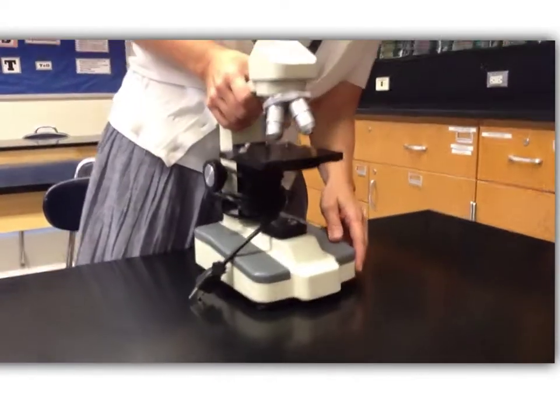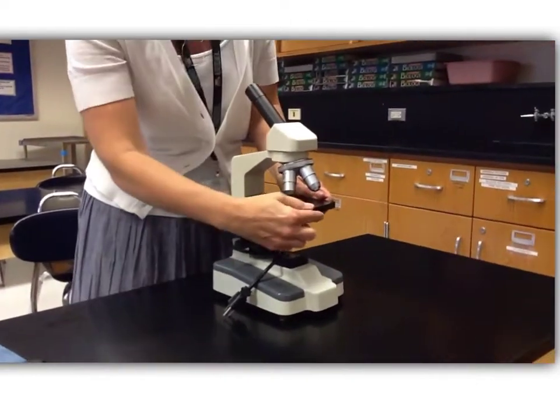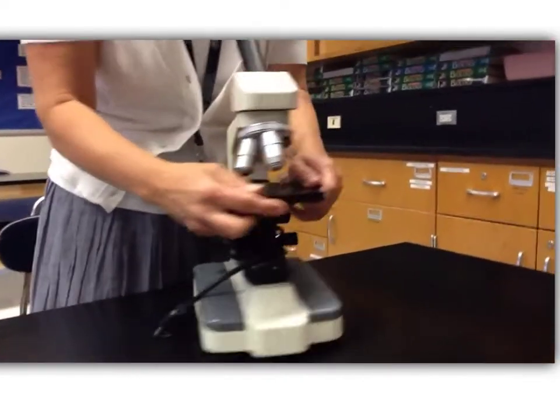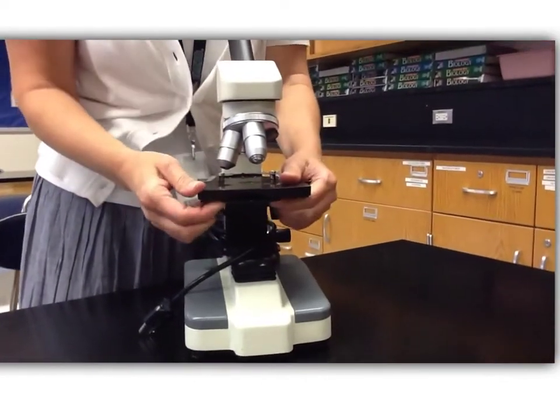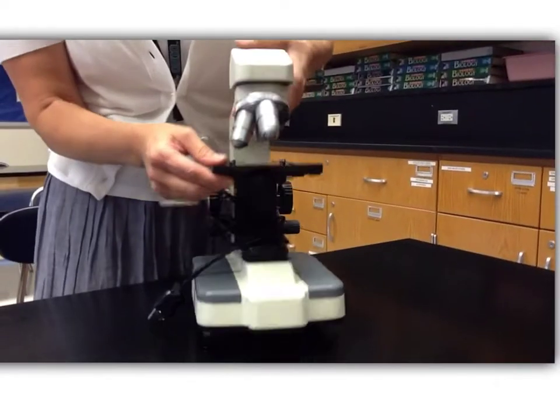You are going to also need to adjust the light because the light coming through the stage is going to need to be adjusted using this little knob here. This is called the diaphragm, and its job is to adjust how much light comes through.